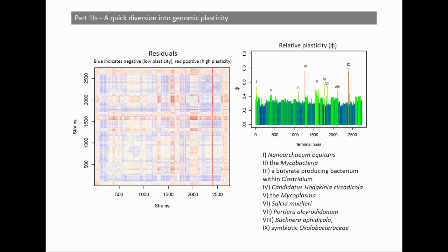This is a somewhat older plot, so there are far fewer genomes than are currently present within the PAPRICA database. But what you'll notice here is that bacteria and archaea that have a high phi parameter are consistent with clades of bacteria that are known to have high rates of horizontal gene transfer or extremely streamlined genomes.